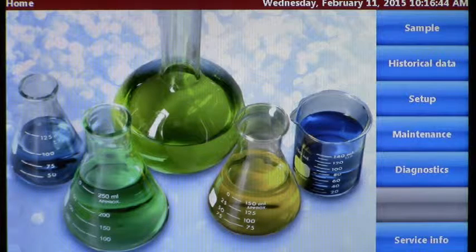Welcome to the HIAC 8011 Plus how-to video series. Today we're going to be discussing how to perform the instrument setup.